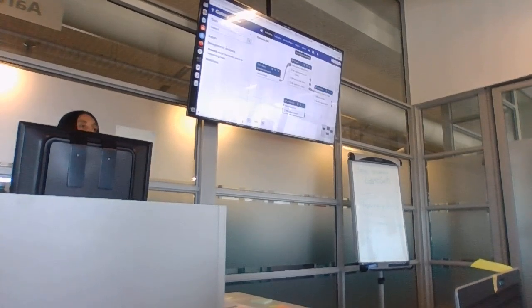Okay, let's just do the last step so that we can go on lunch. So you can see that we've searched for Kraken, we've added it. But Kraken is kind of just hanging there in the middle of nowhere. It doesn't know what to receive as input.